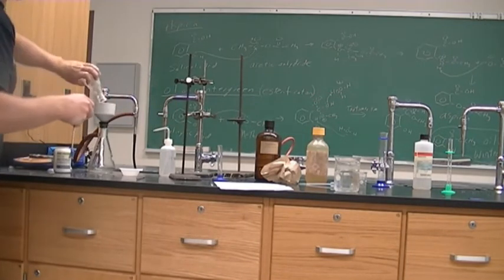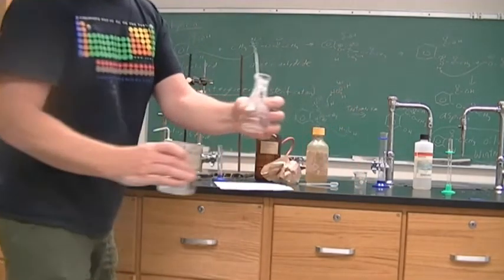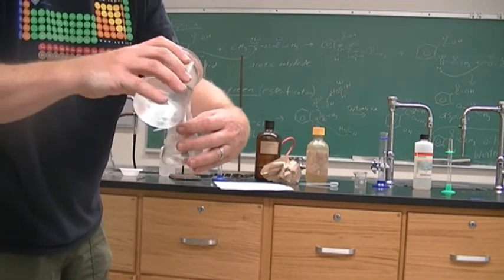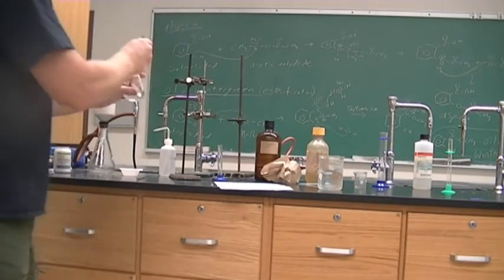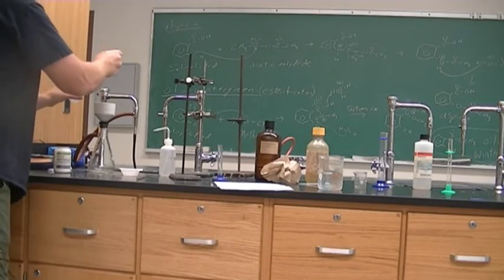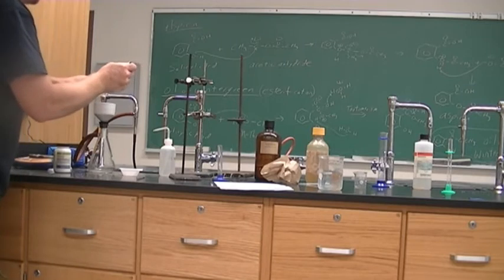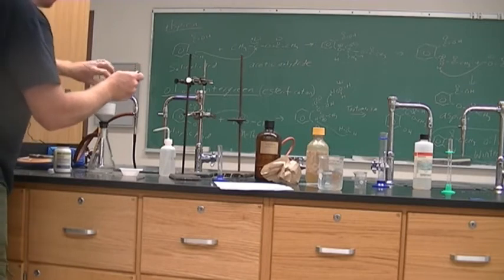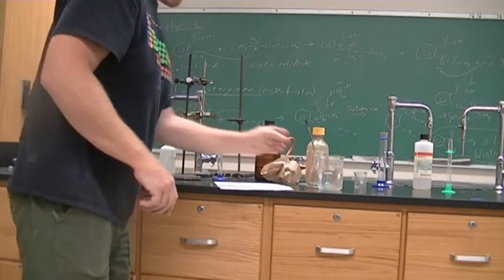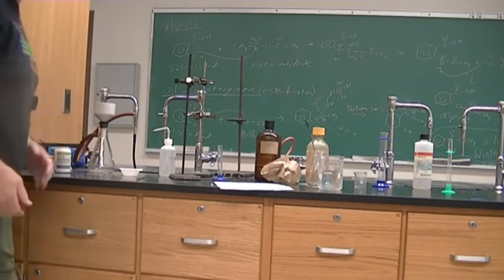The amount of solid that is dissolving is being made up by the amount of solid that is still coming out of this Erlenmeyer flask. So although we are dissolving some of our product, we are also transferring product into there, and so we're getting a cleaner aspirin. And then we let it dry. I've run it through 3 times, and now it's sucking the air through there, drying our aspirin.